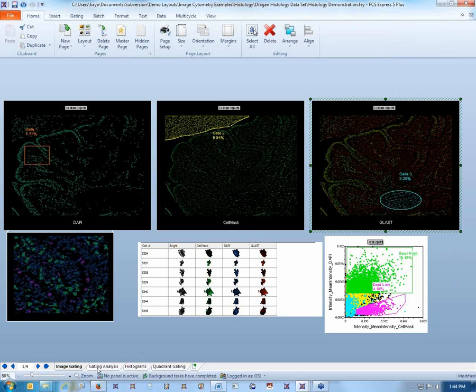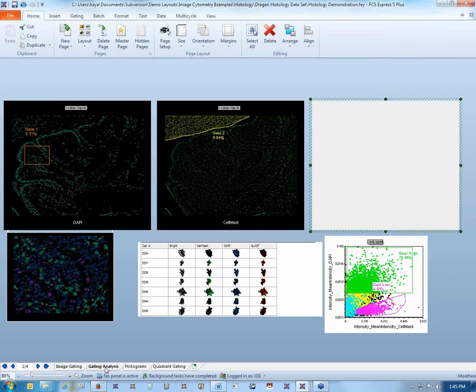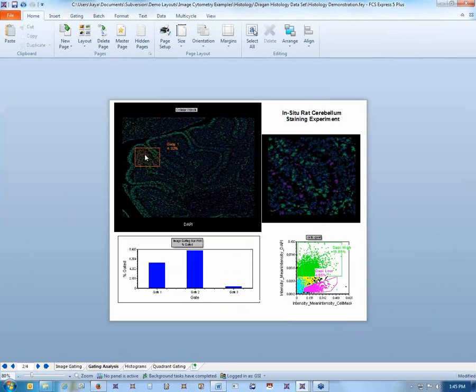All right, and of course, you can also do lots of cool things like making bar plots and things like that that are going to update as you move your gates. So here I'm comparing gate 1, gate 2, gate 3 in the bar plot, and that's all updating as well. Okay, and we've made FCS Express 5 very fast, so even if you're already used to FCS Express V4 for your imaging files, definitely try downloading the V5 demo. I think you'll be really impressed.